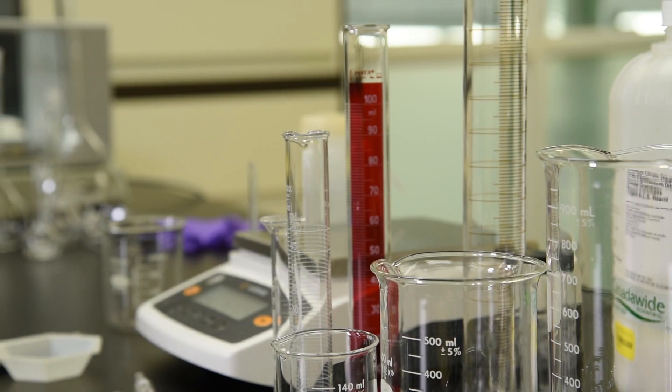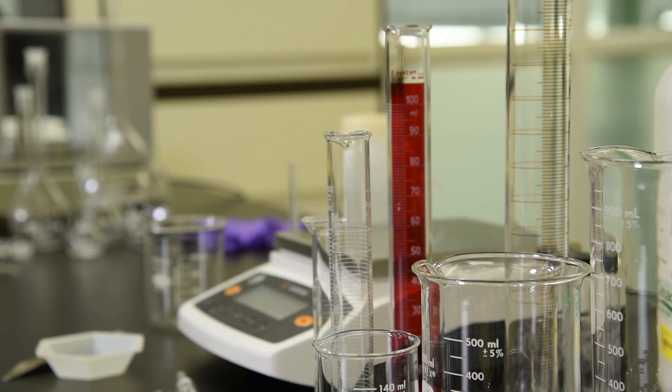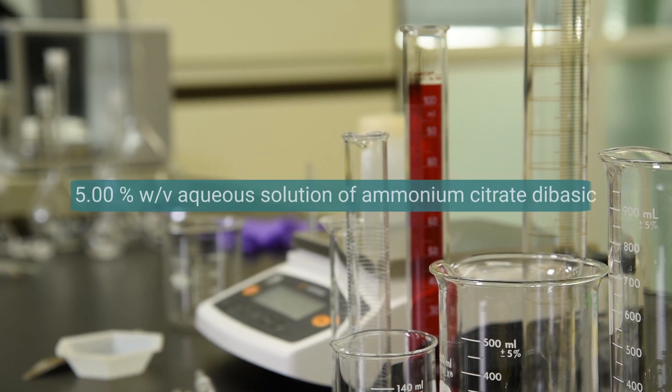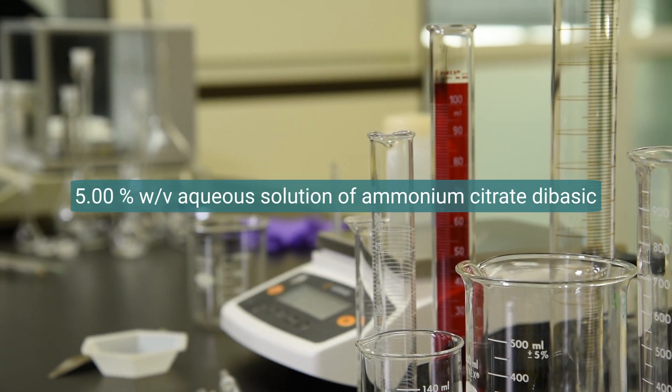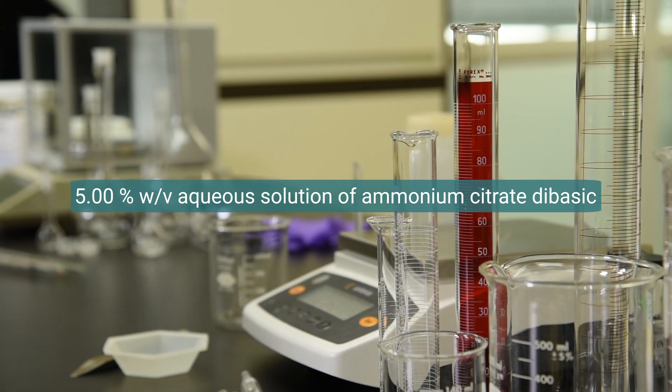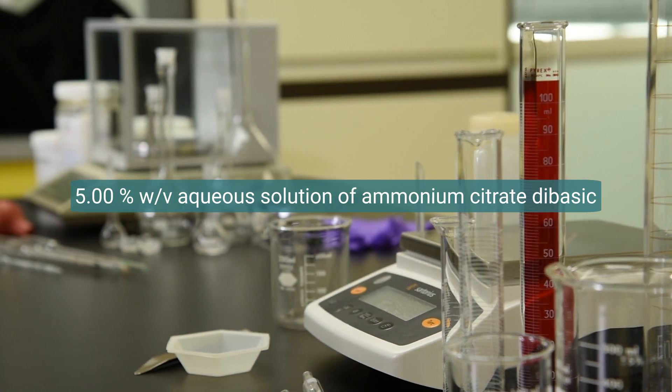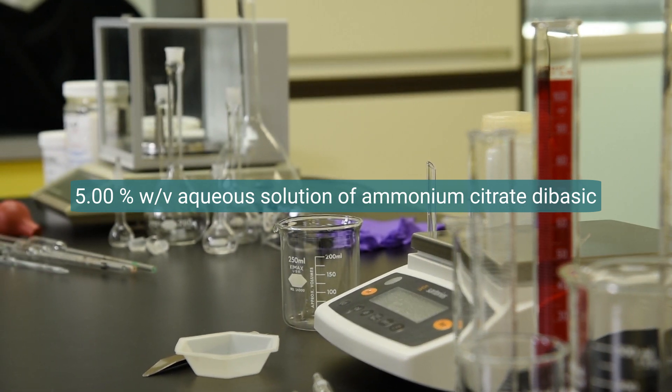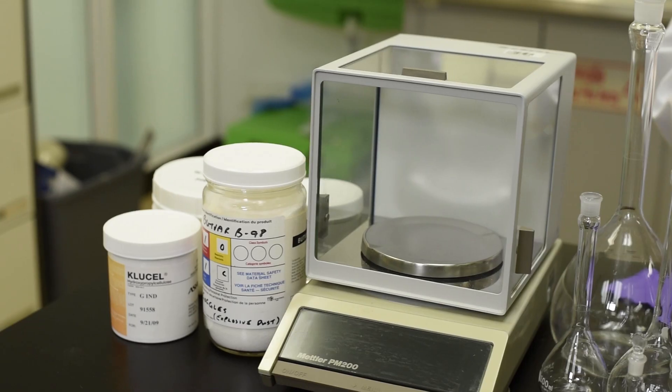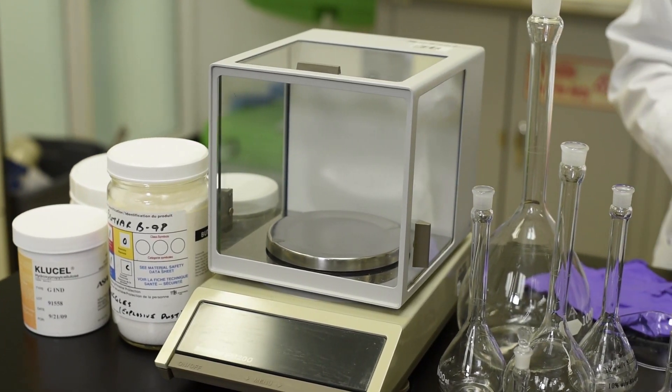Now let's get into the procedure for making solutions. I want to make a 100 milliliter solution of 5.00 percent weight by volume ammonium citrate dibasic in water. I would like my methods to be accurate and reproducible so that other conservators will be able to recreate my concentration. To do this, I will use the analytical balance and a volumetric flask.